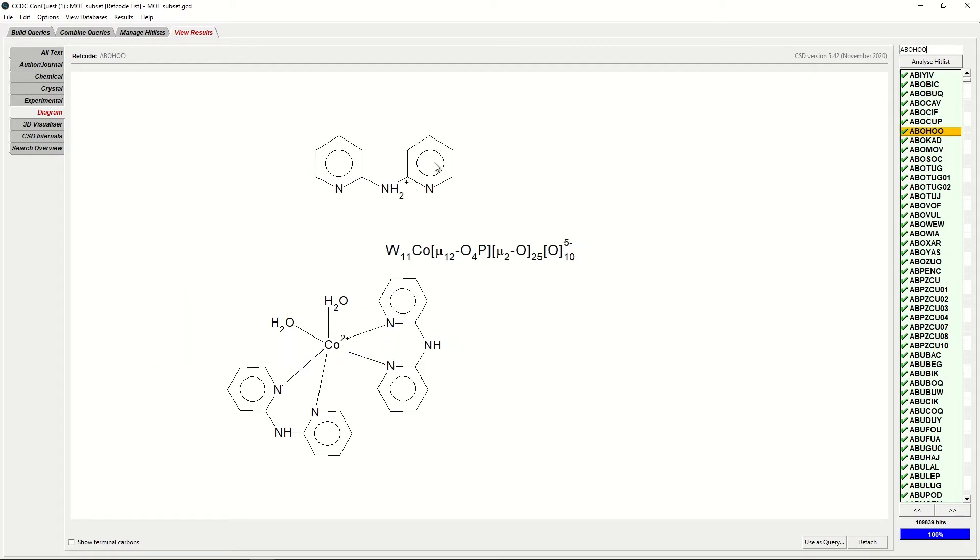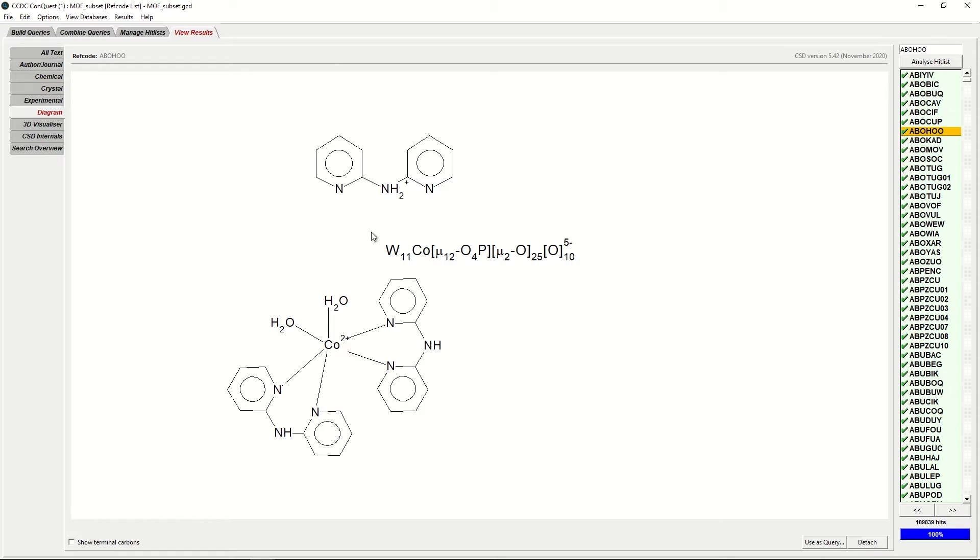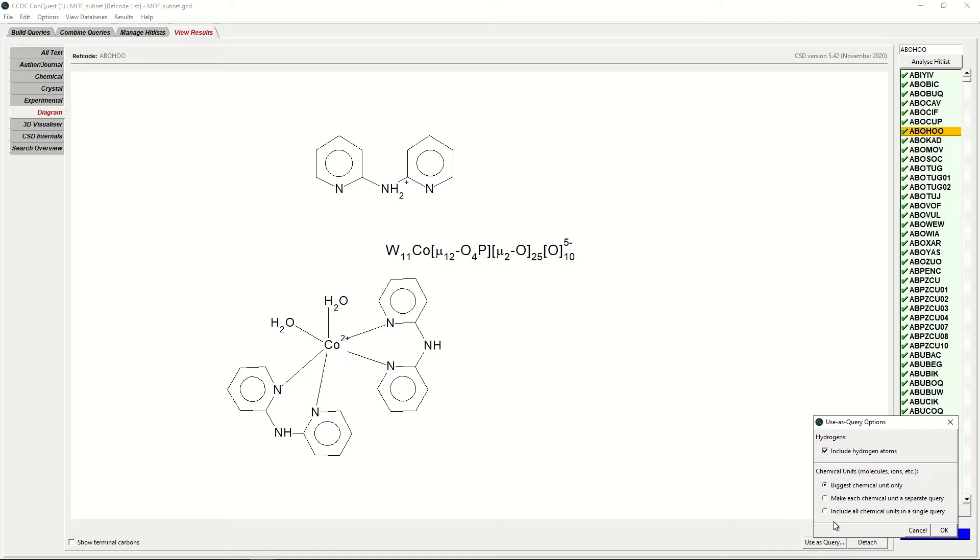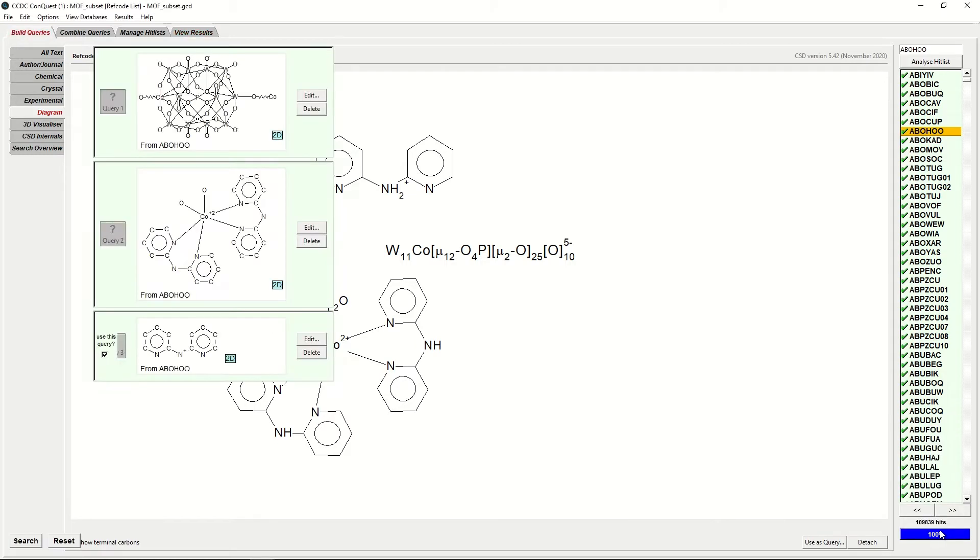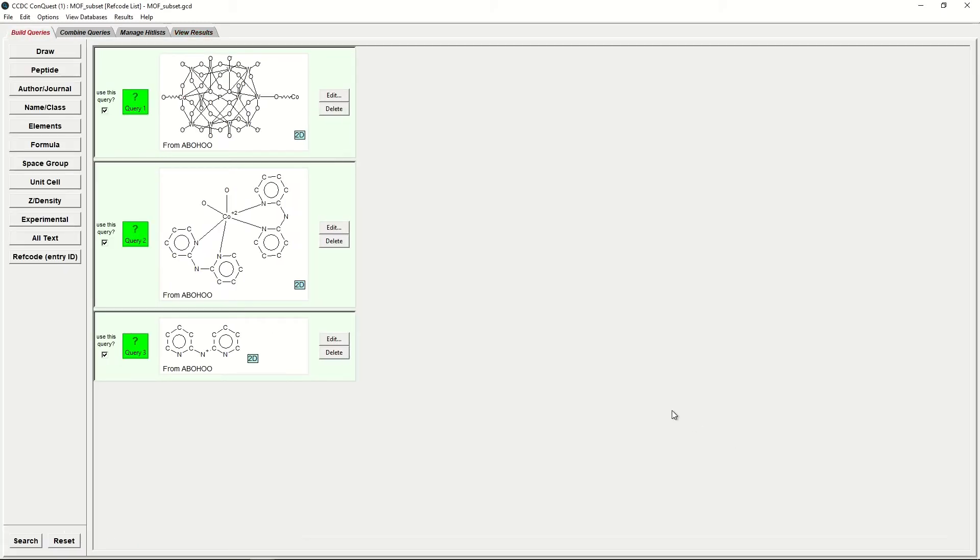You can see three components here. However, we are interested in basing our search on the dipyridyl ammonium ligand, so we just want to separate out these components. In order to separate them out, we can tick Use as Query and tick Make each chemical unit a separate query. I'm going to untick Include Hydrogen Atoms as well. Then tick OK, and it will create three separate queries for each of the components.